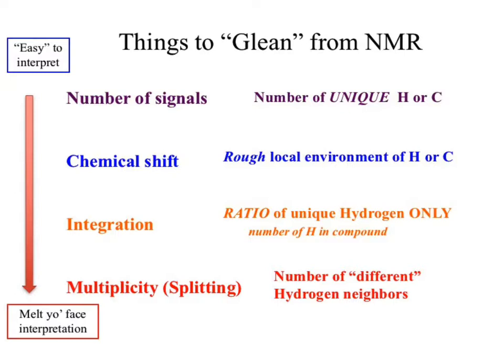Okay? That's because they spent 50 hours dealing with the number of signals, chemical shift, and integration, that they've now internalized all of those questions. And they're now jumping to the hardest part because they've already done the rest of the work. You haven't done that work. Do it first. Okay? The other part on why you should do it first, is there information in that area?